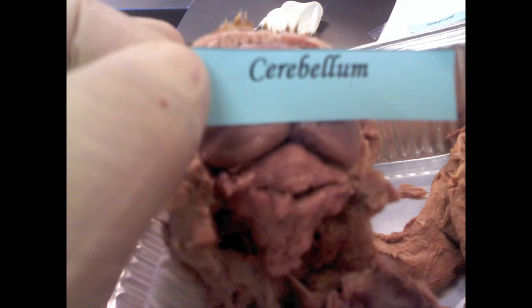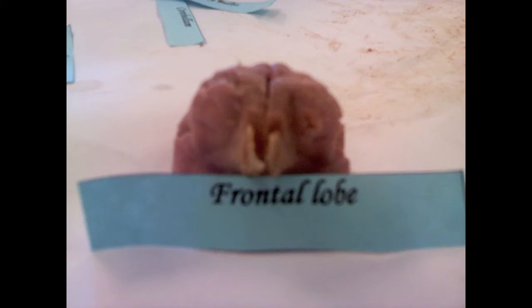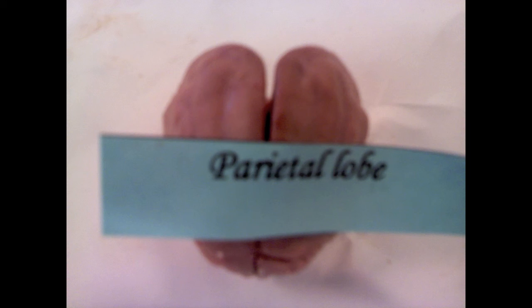The cerebellum controls coordination of movement and balance. Olfactory bulbs are involved in the perception of odors. The frontal lobe controls movement. The parietal lobe controls sensation.